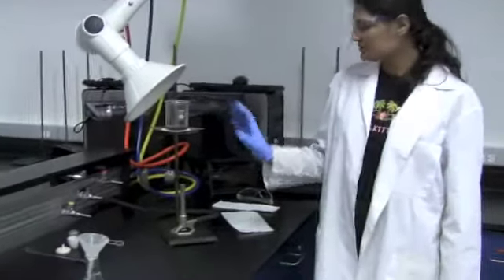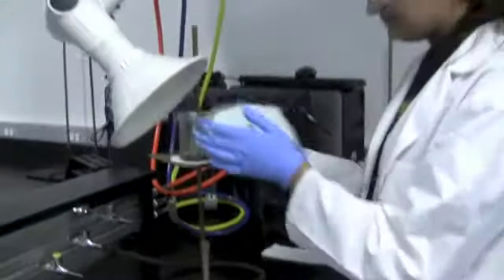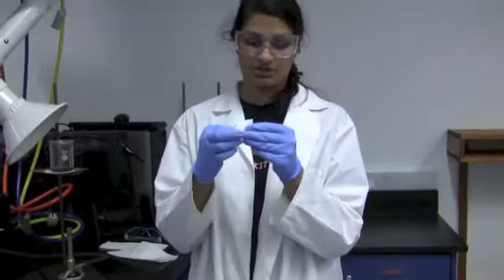Now, once your aluminum dissolves, you might have some black particles remaining. They're going to look like this. To get rid of these, you're going to want to filter them out. Now, you're going to take some filter paper, you're going to fold it in half, and fold it in half once again to form a cone shape.